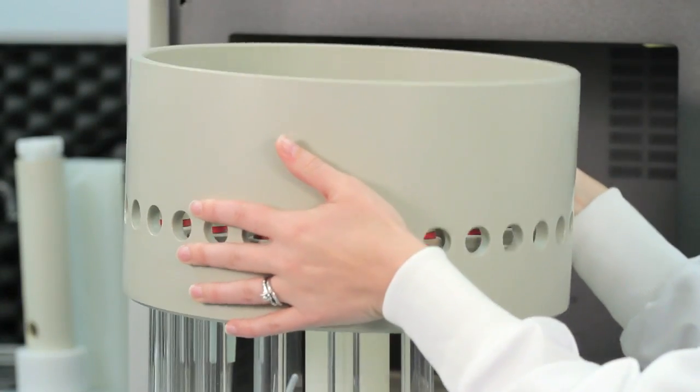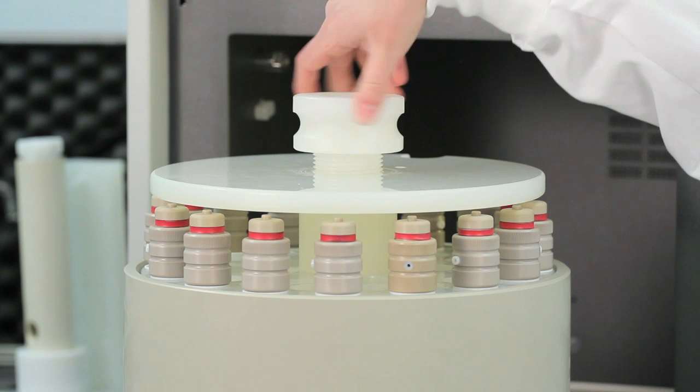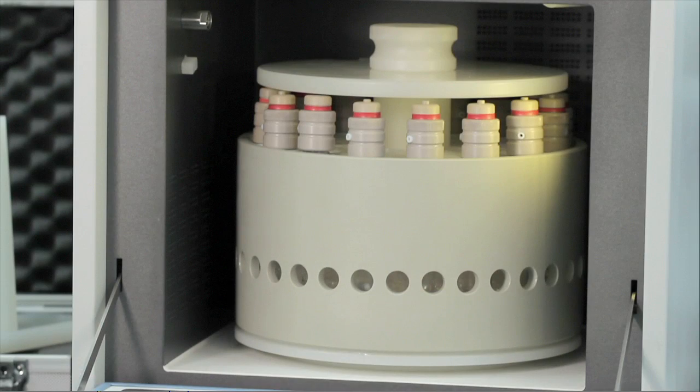After the vessels are fitted onto the rotor, a safety shield gives extra protection. All vessels are under infrared control, so any combination of experiments can be performed. And should the temperature in any one vessel rise over the set limit, the microwave power will automatically shut down.